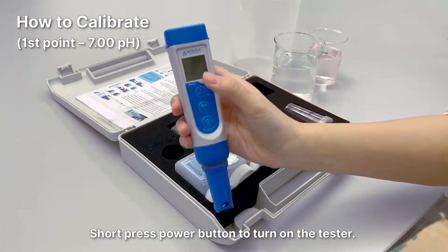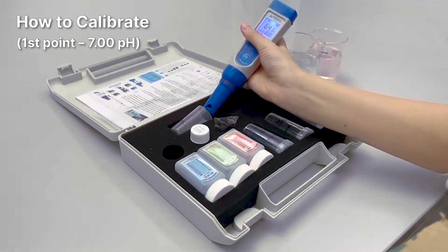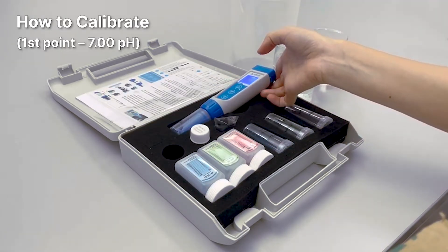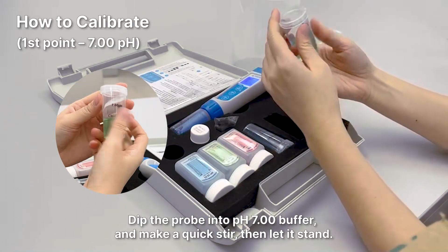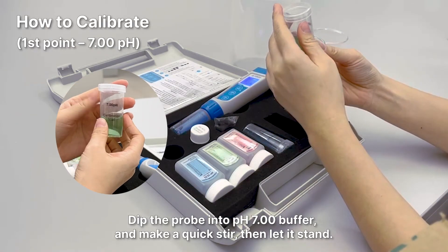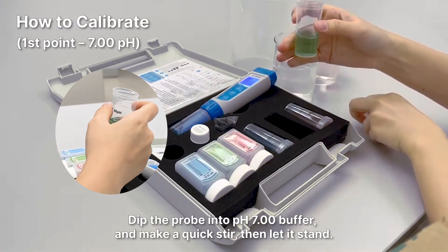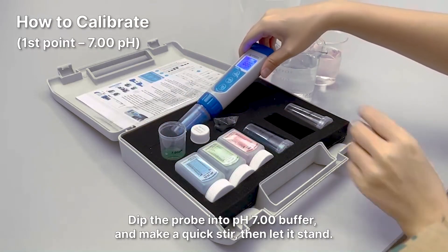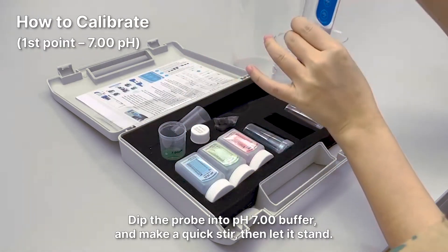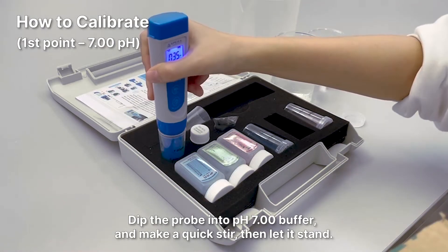Short press the power button to turn on the tester. Dip the probe in the pH 7.00 buffer, make a quick stir, then let it stand.